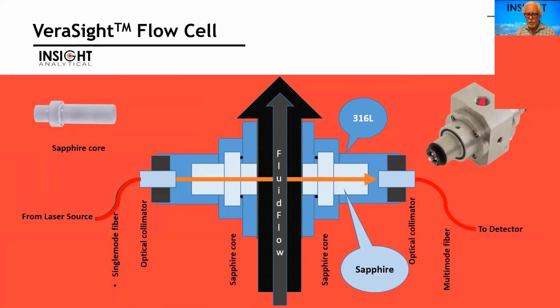So that helps us on the measurement side, but then we want something that's robust for that sample to flow through. So we take what we refer to as a flow cell, and we send our sample of hydrocarbons flowing through it. Whoops, push the window out of the way. My pen is like a 1/16 of an inch too big. There we go. So our liquid hydrocarbons flow between these cells, or between these windows.